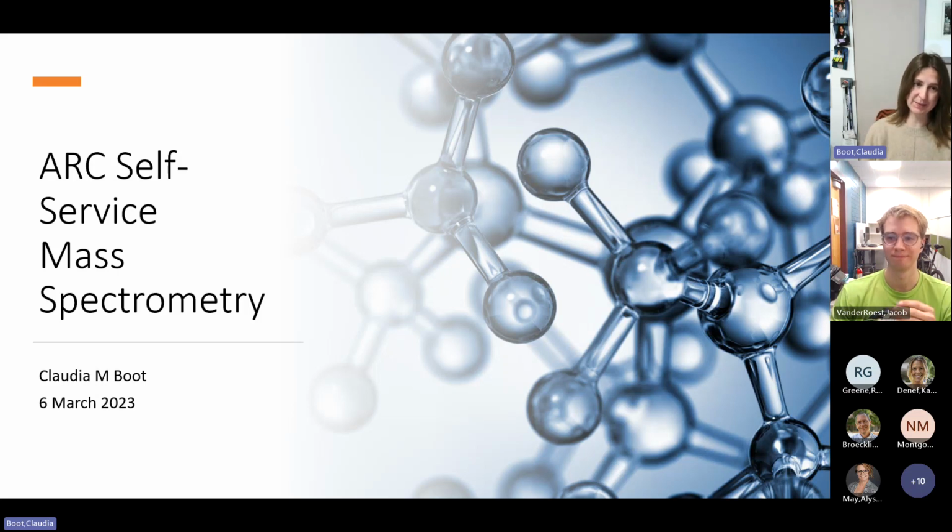So we'll walk through some mass spec basics, what the systems are composed of and what we have here in the ARC. And then we'll walk through instruments one by one and how you get self-service on them, starting with ICP-MS, which is led by Dr. Jackie Chaparro. Then we'll talk about our MALDI, which is led by Dr. Alyssa May, GCMS, led by Paul Matthews, and then the LCMS, which I lead along with Gwen Willits, who's a talented undergraduate who works in our lab.